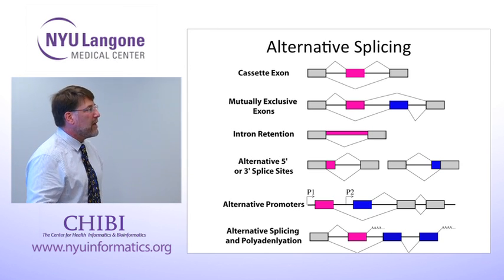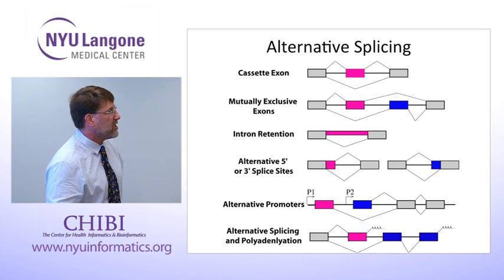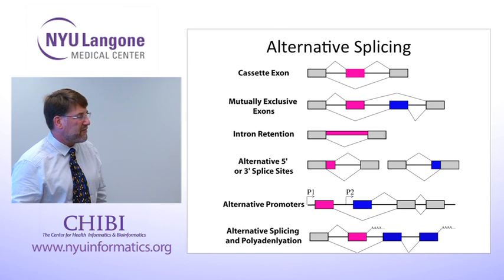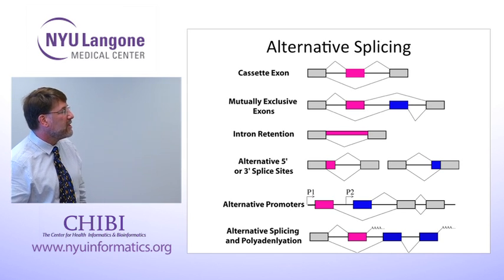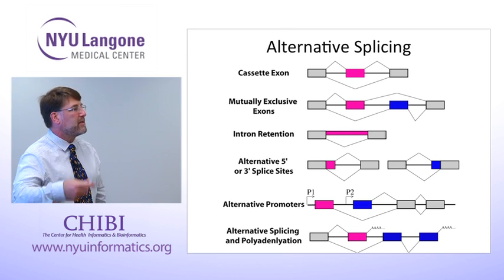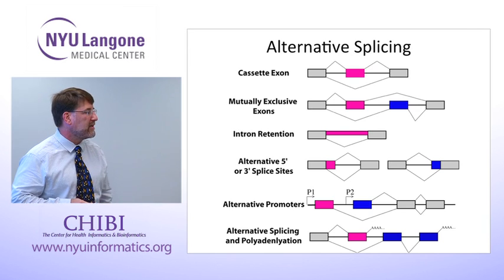On the other hand, if you want to look at the entire genome for every exon and see if it changes with respect to any other exon in the same gene, that's a lot of comparisons. It's in the hundreds of millions of comparisons, and it gives you a very, very high multiple testing correction and a very, very high chance to find false positives.